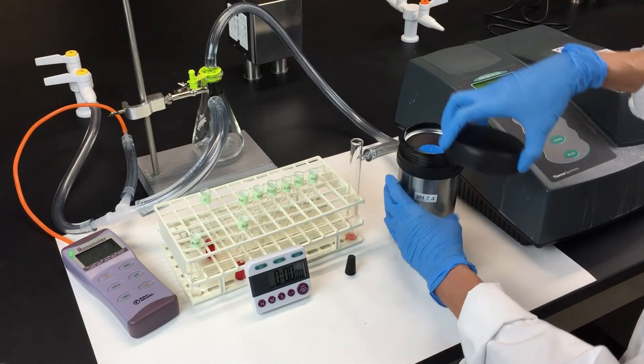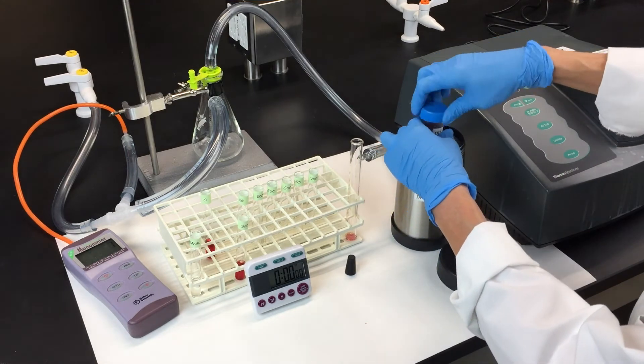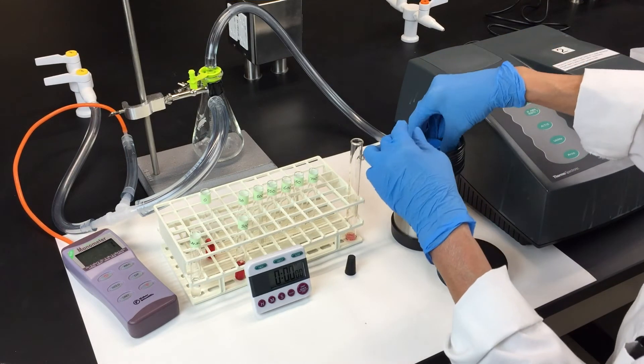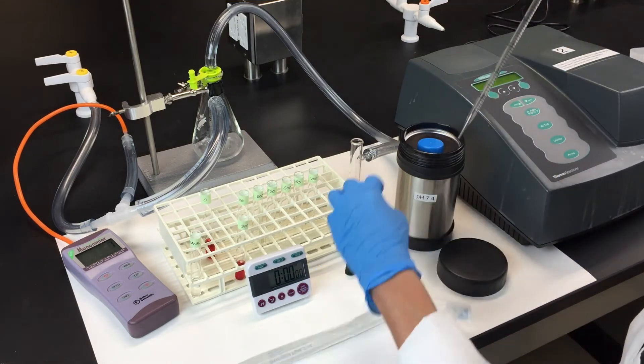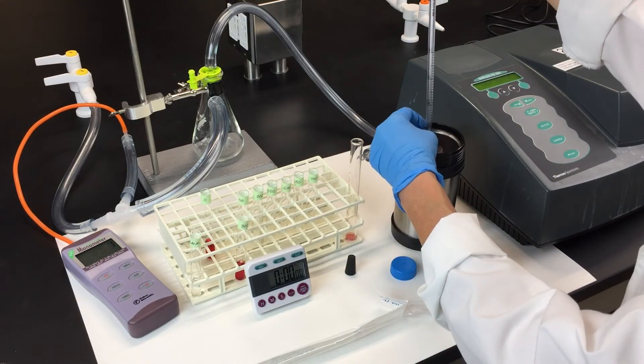Now we'll jump ahead to the 700 millimeter mercury tube, just to show you what happens to the hemolysate under high vacuum pressures. Transfer 2.5 milliliters of the hemolysate to the sidearm tube.